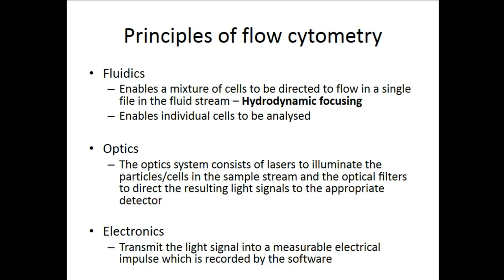Okay, so you need to know the basic principles of a flow cytometer. And the basic principles of a flow cytometer start with the fluidics. Okay? It enables a mixture of cells to be directed to flow in a single file in the fluid stream. And this process of enabling the mixture of cells to go into a single file stream is called hydrodynamic focusing.